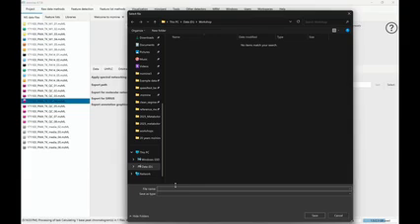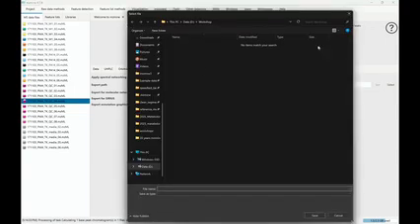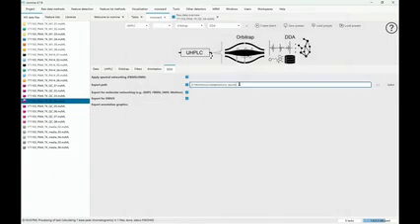So we can say, for example, Metabolomics results. This is the base file name, and mzmine is going to generate a lot of different files and always going to add something to it like GNPS export, series export, the feature table, the mass spectra. We export many, many things and just put some suffixes to it. So again, for DDA, you select a base file name and write it in there. And make sure it's a file path that's actually reachable on your computer.